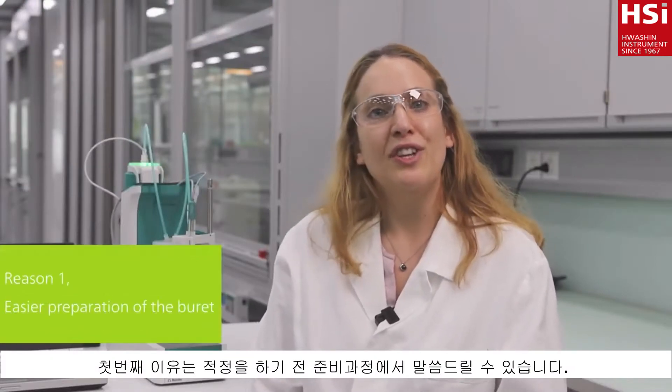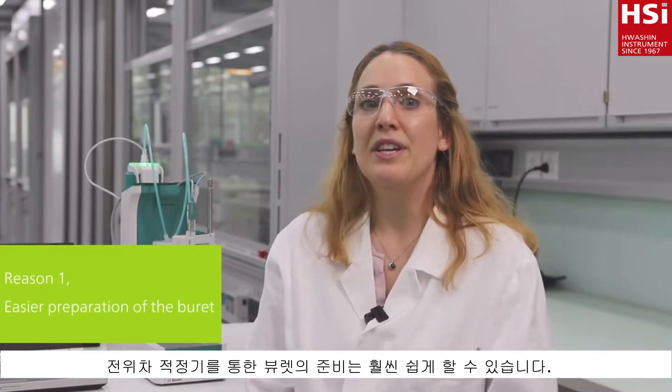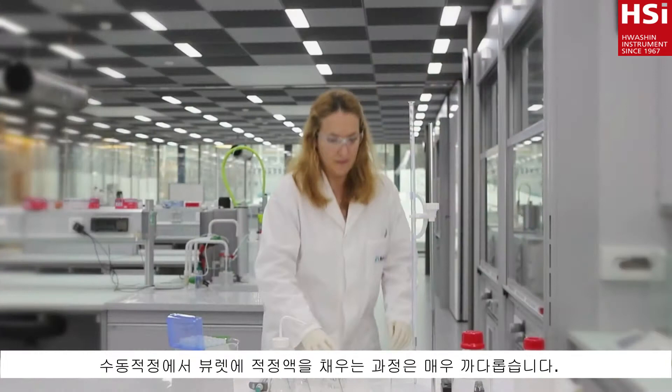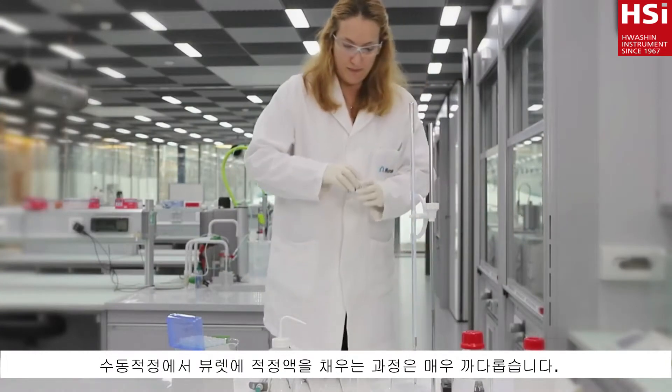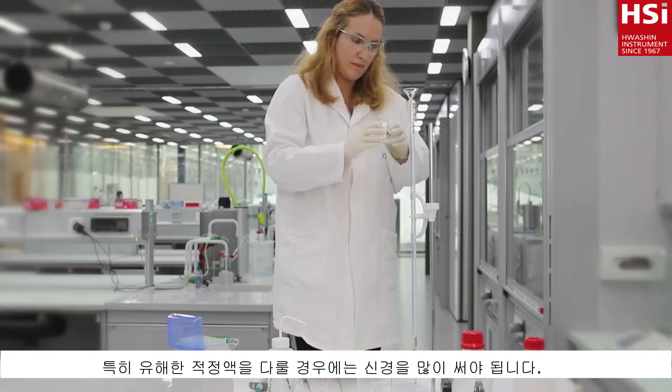My first reason comes already into play before I start the titration. With automatic titration, preparation of the burette is much easier. Filling the burette manually can be tricky and you have to be very careful when you are handling corrosive titrants.